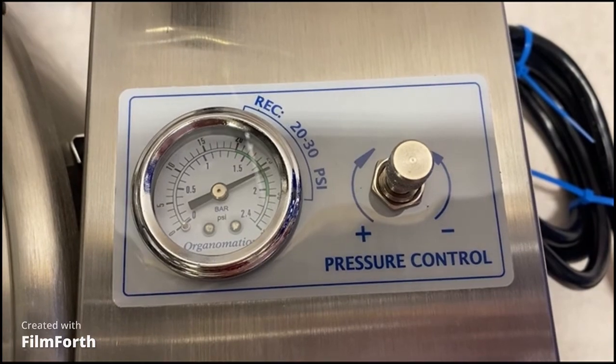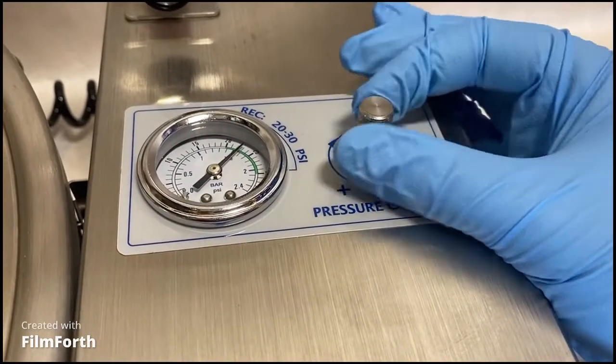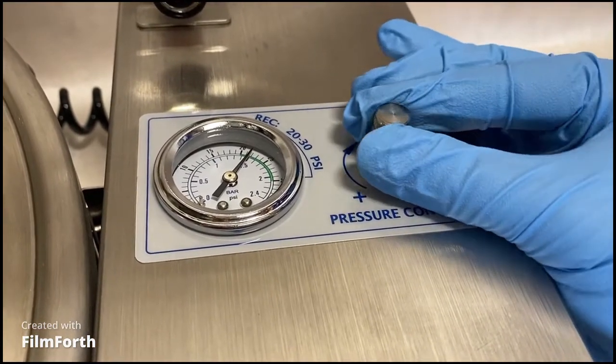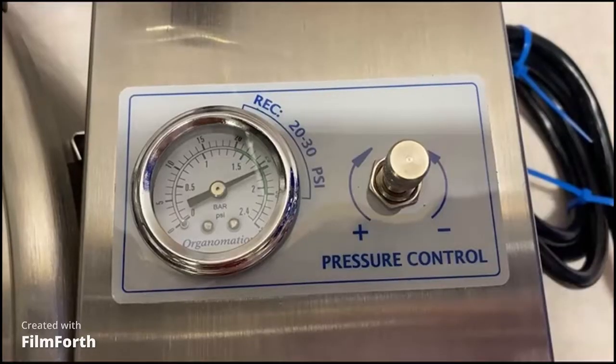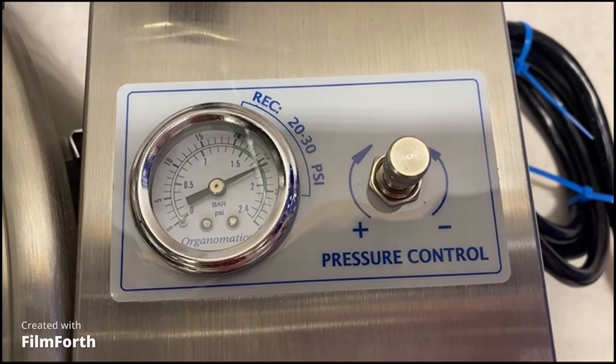To do so, locate the knob on the top of the unit labeled flow meter. Rotate it clockwise and observe the pressure gauge for movement. The gauge should go up when the knob is turned clockwise and down when it is turned counterclockwise. If the gauge responds, set it between 20 to 30 psi. Turn on the gas switch and recheck the flow.